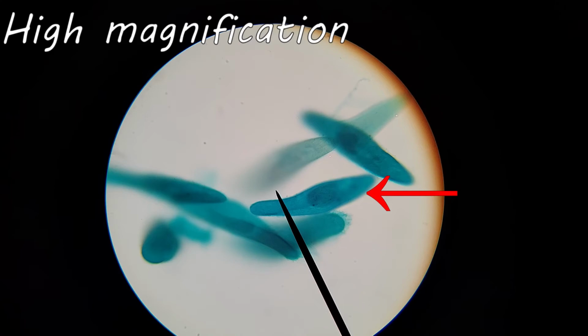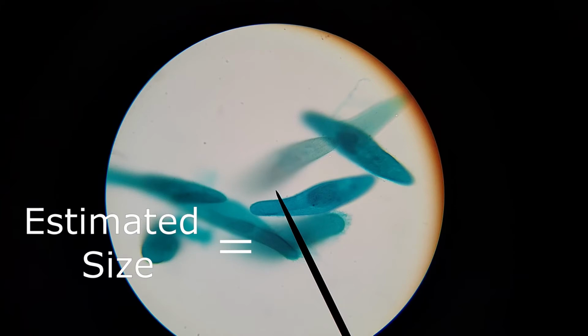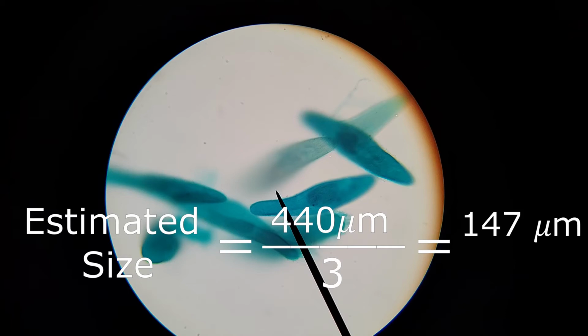Take a moment to pause the video and calculate the estimated size of the following paramecium under high power. Our field diameter under high power is 440 micrometers, and it appears to me that we can fit approximately 3 paramecium across the entire field of view. So we take 440 micrometers, divide it by 3 paramecium, and that means we should get approximately 147 micrometers.